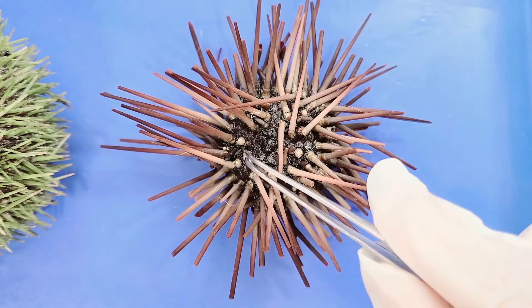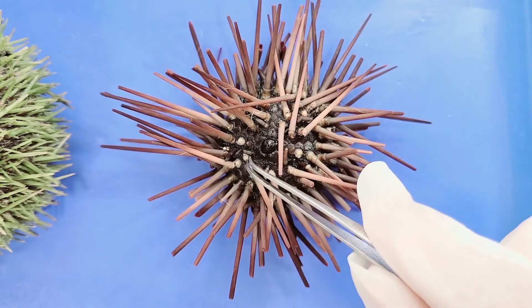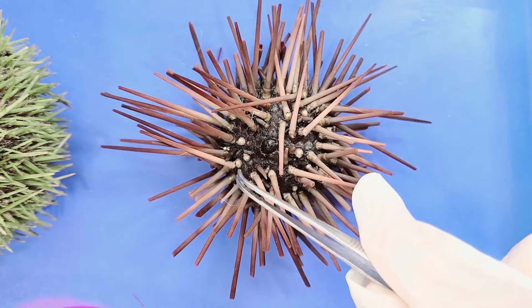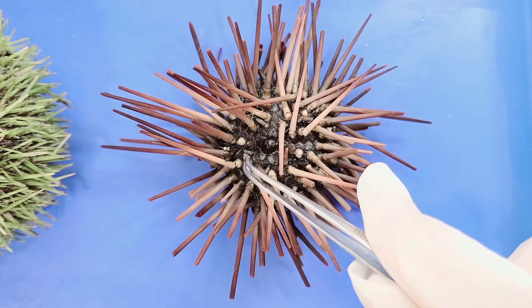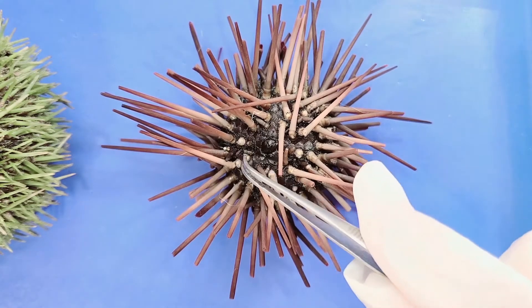You can see these bumps where some of the spines have snapped off, and these small knobs where spines are attached are called tubercles. We can also see them on the green sea urchin, but they're easier to see here.